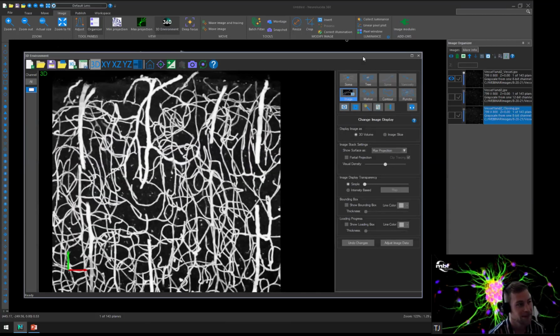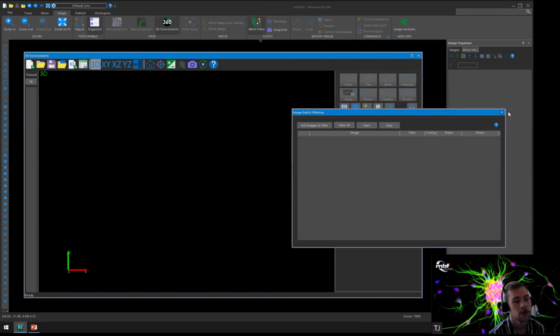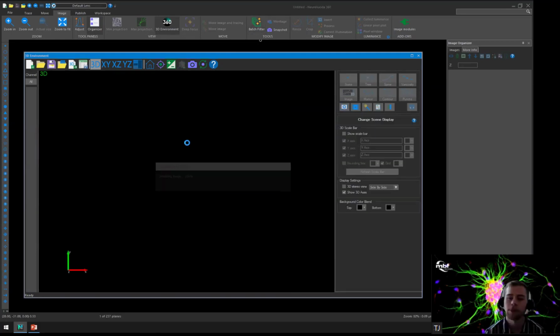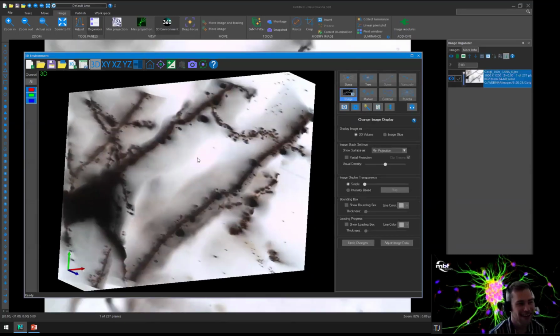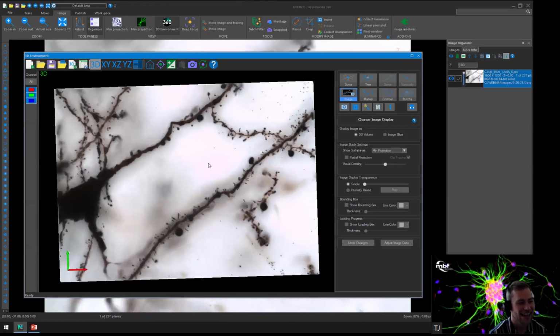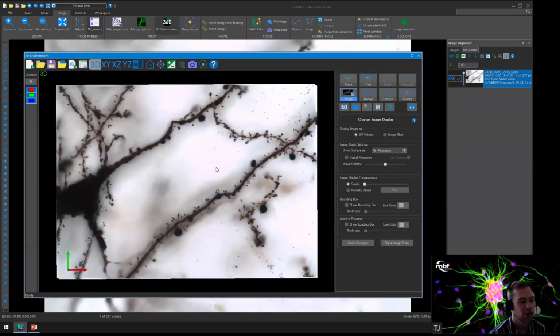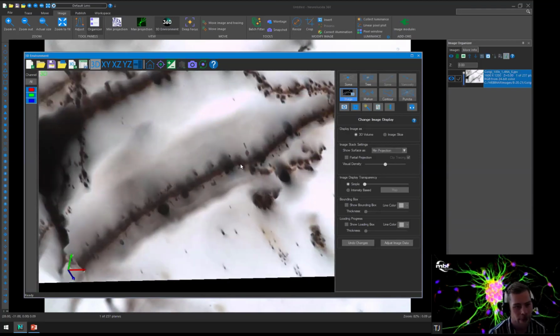And lastly, we have our Golgi filter that I'd like to show. Golgi is always a troublesome labeling agent. It's tricky, it's a little messy, and it always sort of leads to these blurring issues when we get to the three-dimensional aspect of our image data.